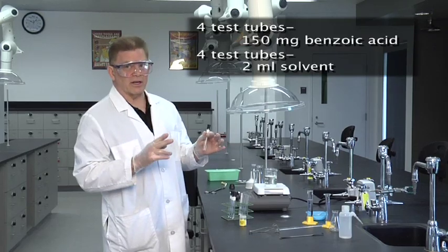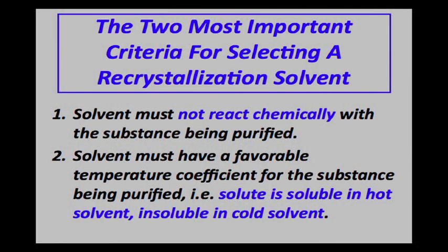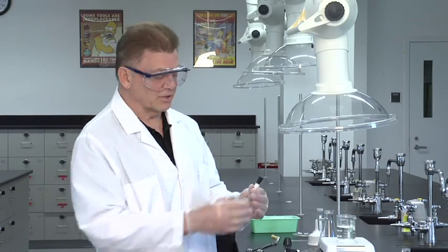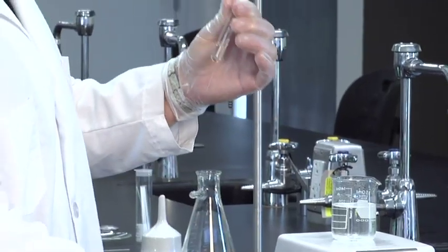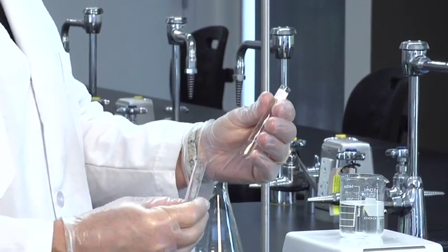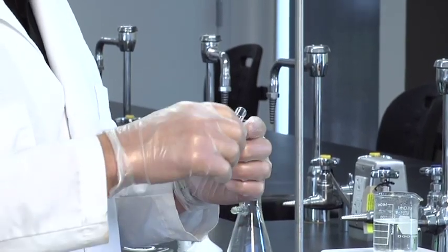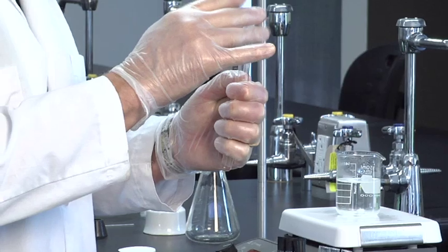The two main criteria for a recrystallization solvent are: the solvent cannot react with the compound, and the benzoic acid needs to be soluble hot and insoluble cold. So if we put the benzoic acid in at room temperature and it dissolves, this will not be an appropriate recrystallization solvent. The first one I've selected is methanol — we'll often use methanol as a recrystallization solvent in some of our other experiments. I'm going to dump the 150 milligrams into the test tube with the methanol.